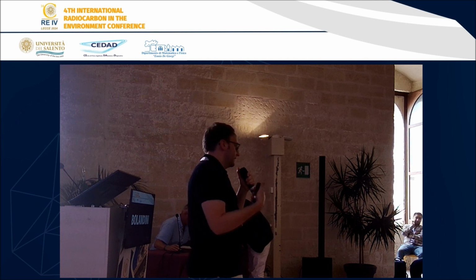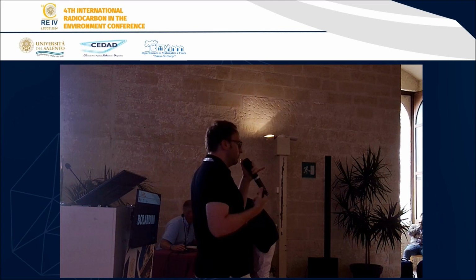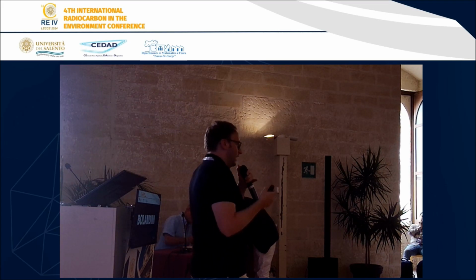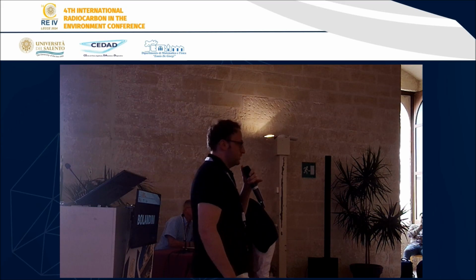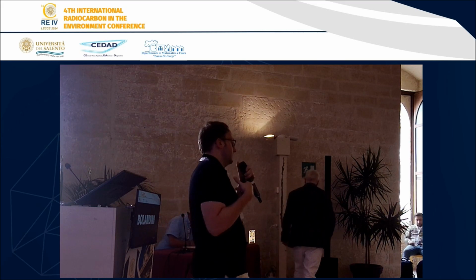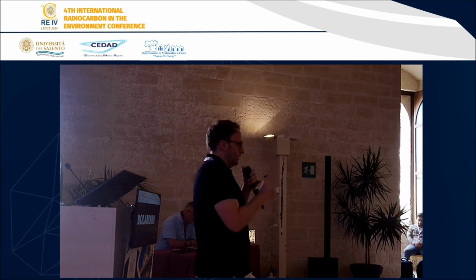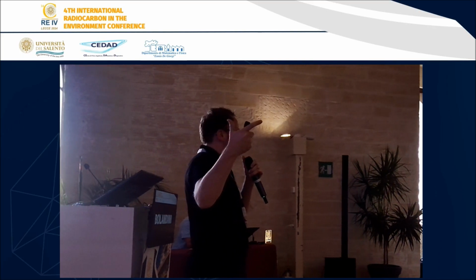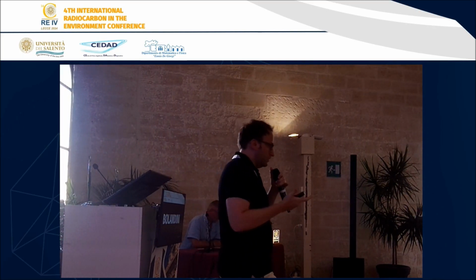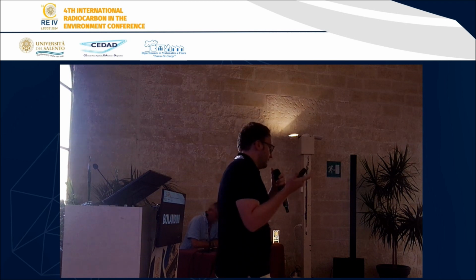The next step is that we are comparing with the university AVI to see what's actually happening. We could already see that the internal reproducibility is there, but when we want to compare to the NOSAMS, which are using pyrolysis, we need to adjust, for example, the oxygen amount, lowering it, or also the masses.